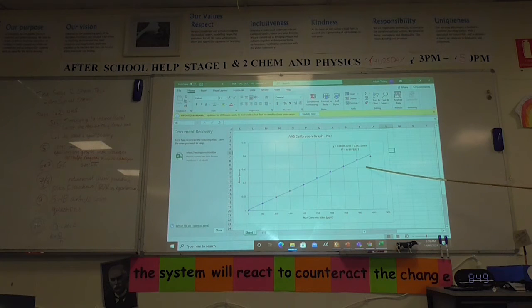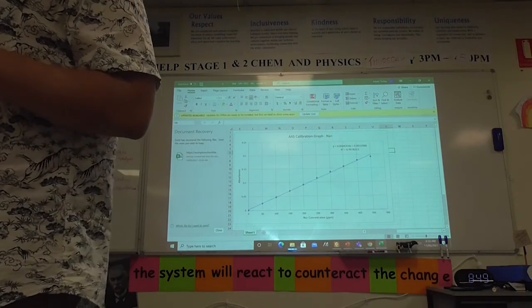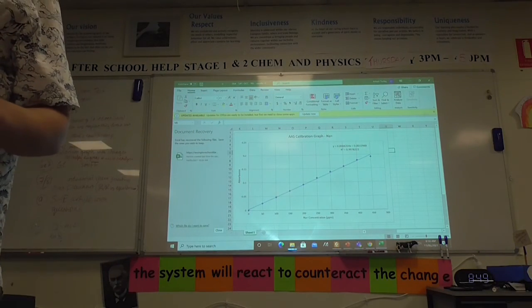There are limitations. When you look here, you can see 0.003298. That's a y-intercept. That means that you're not going through the origin of the graph. What should the absorbance be when you have distilled water? 0, that's right. This is telling us that we've got sodium present in a sample of distilled water. Is that possible? Yes, of course it is, in incredibly trace amounts. However, we make the assumption that it's not.